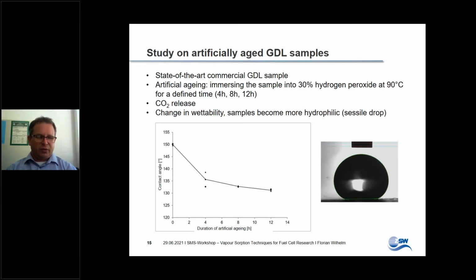But you just see the surfaces, you don't see the inside. And you have no idea what actually changes. I mean, from the underlying physics, it's clear that something with the surface energies of the sample has to change. But the second influence could also, of course, be some changes in geometry.